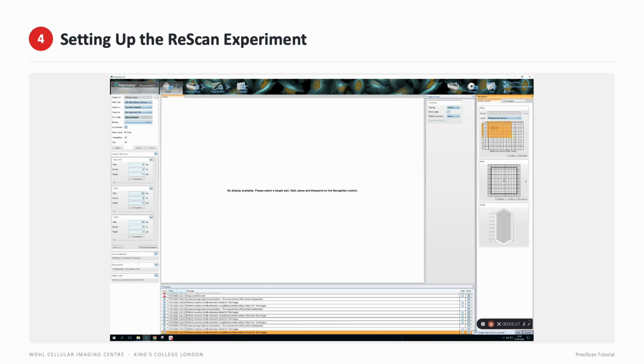You can decide here, again, if you want a 3D stack or if 2D rescan is sufficient. So here you can see I'm removing the stack and defining a height for each channel because I've decided I don't need 3D rescan. You can also, because I've built this based off of the PreciScan experiment, the online job analysis was still there, so you can safely remove that.